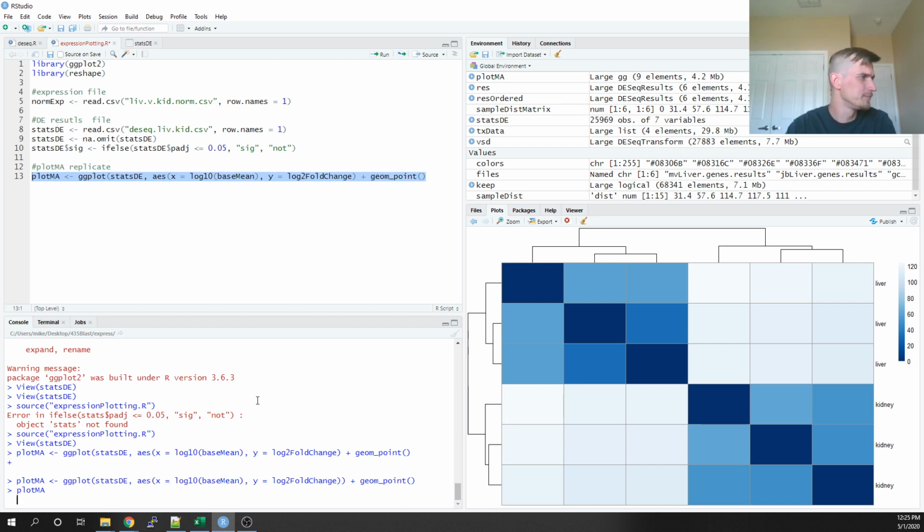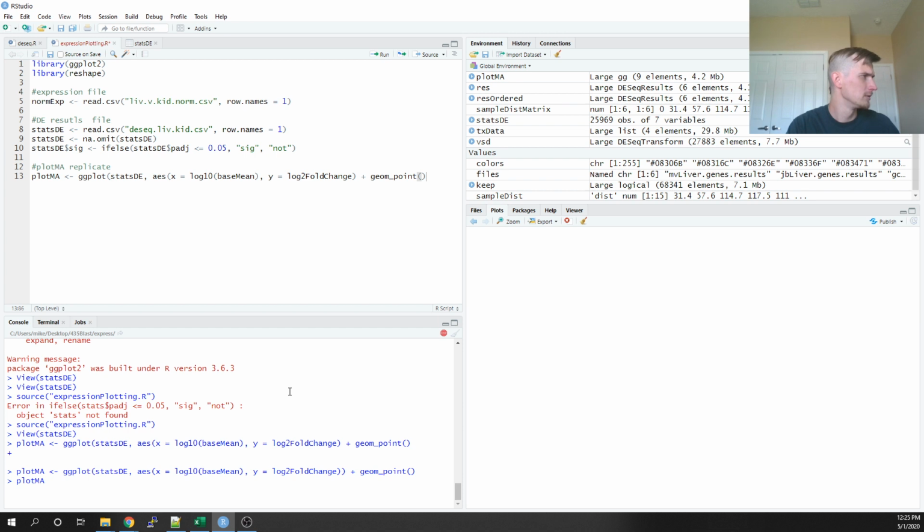Come on, homie. Just give this one a second to get going. Just a lot of data points in here. There we go.